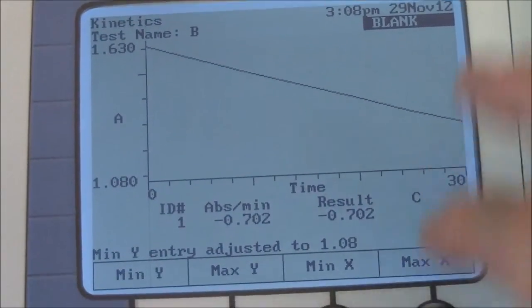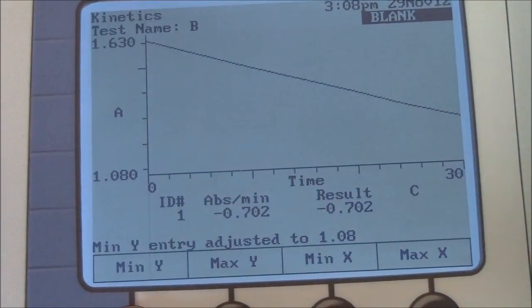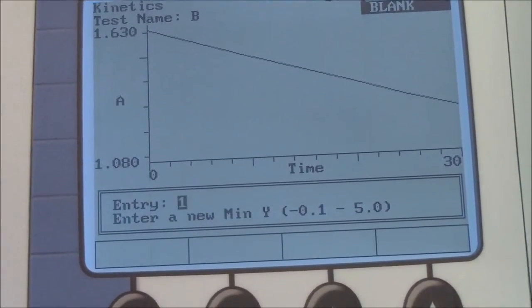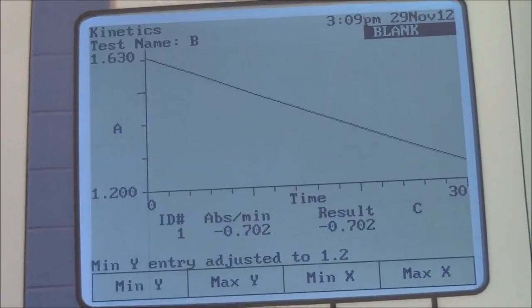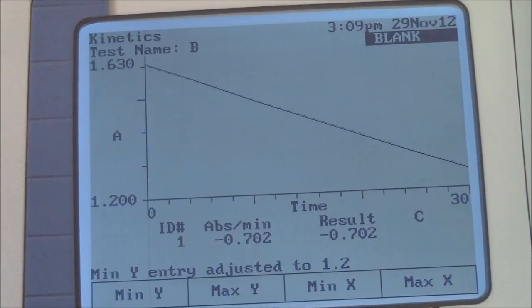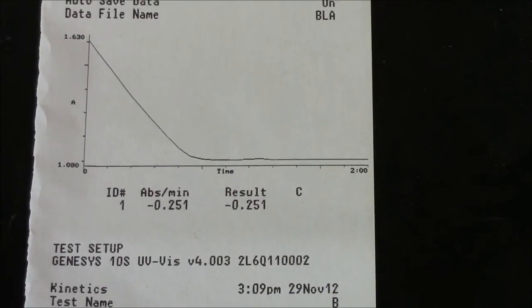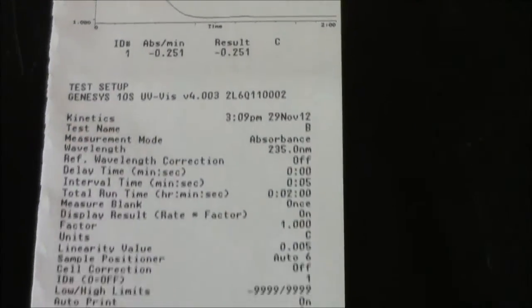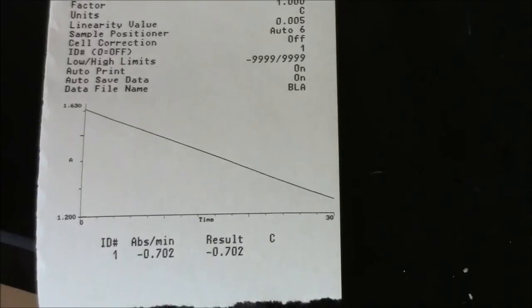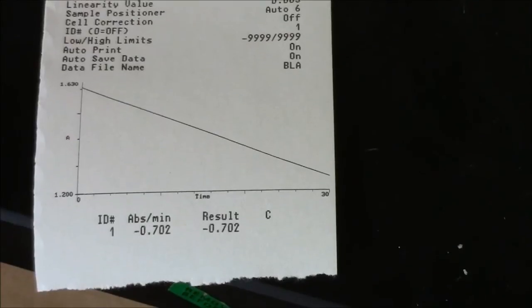Before I print this, I'll make it look a little prettier by adjusting the y scale. Min y could be 1.2 — it would look better that way. And I'll print this. Here's the original unscaled graph with a rate of negative 0.251 absorbance units per minute. And here is the modified graph with a much faster rate, which is more realistic to what the enzyme actually did.